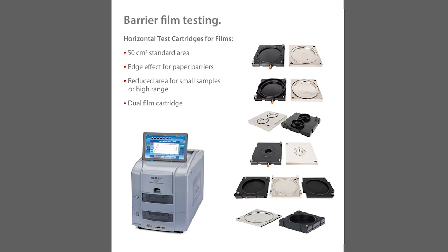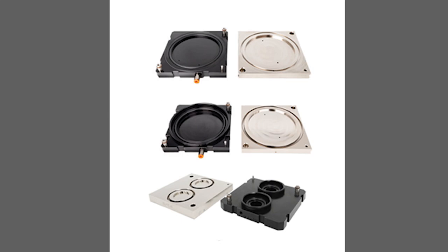The last thing I'm going to talk about is the film testing. I showed you the schematic for it, and again, I want to help you envision what it looks like. Our systems have a cartridge system, so we'll have a bottom and a top to a cartridge. For the very standard cartridge, this area defined by the O-ring is about 50 centimeters squared, roughly the footprint of a coffee mug. It'll take a sample that's roughly 4 by 4 inch squared, and we'll trim the corners.